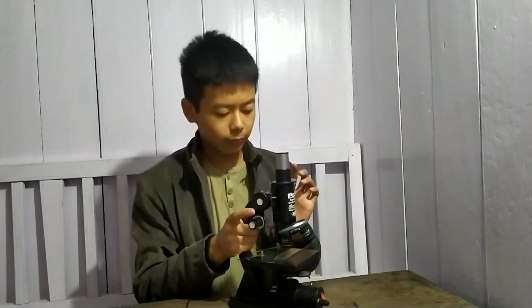Yes, but some of you will wonder how these organisms live on dogs. In the dog fur, they live and survive, eating, or we can say sucking, the blood of the organism or the host. So it is a parasite. It is an ectoparasite, which means it is found externally, not internally.